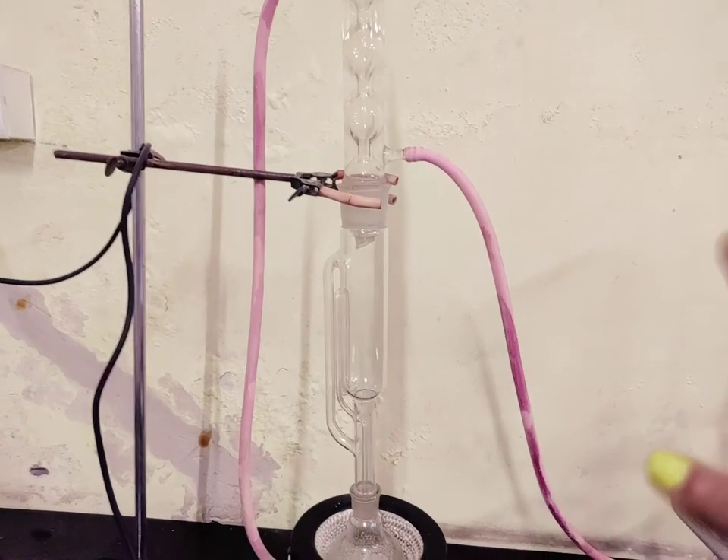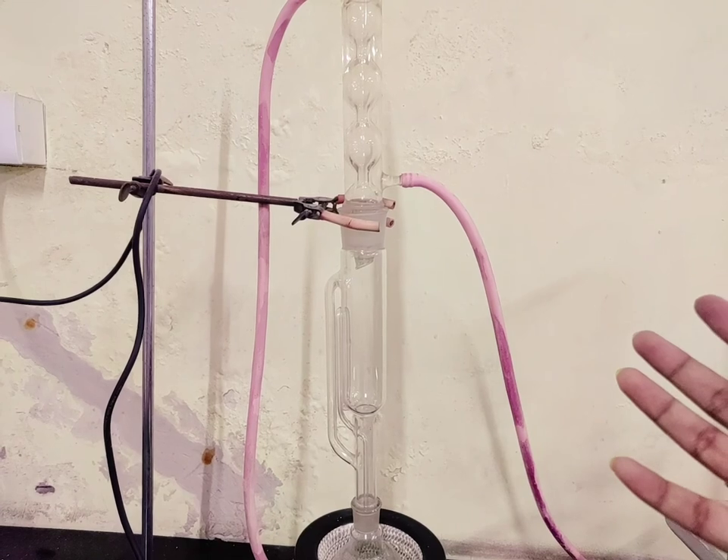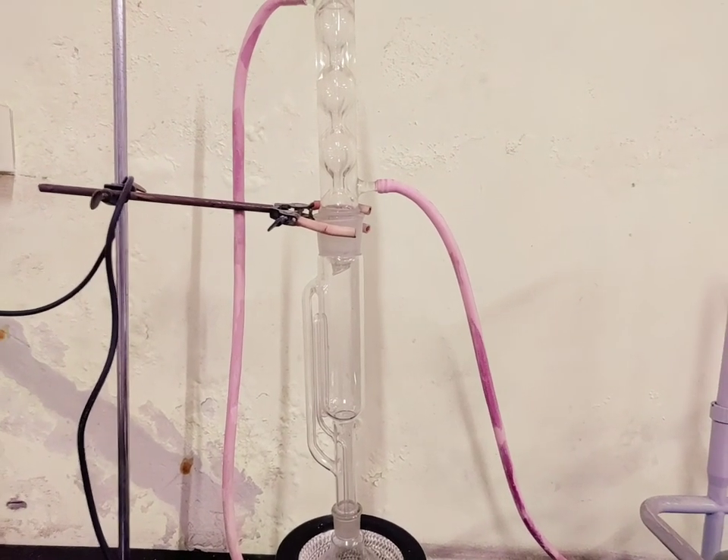I hope this is clear. When you study the theory and principles of the Soxhlet apparatus, I hope it will be even more clear to you how the fat is being extracted from the sample.